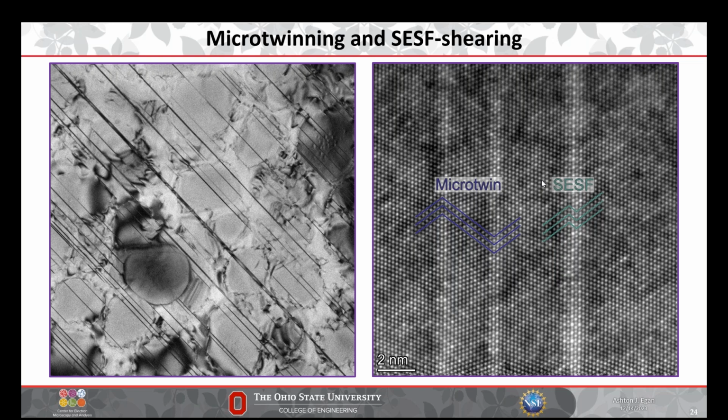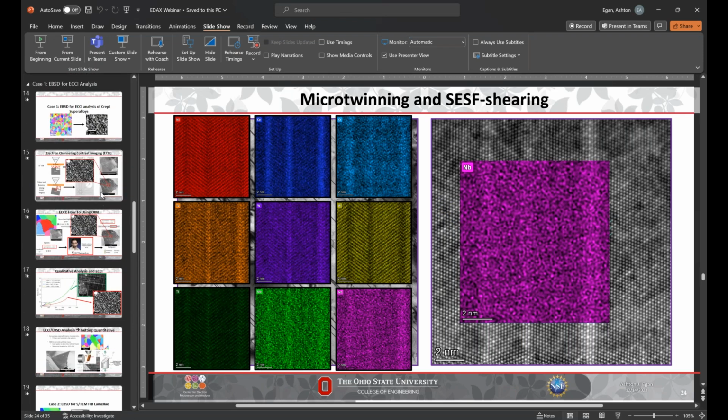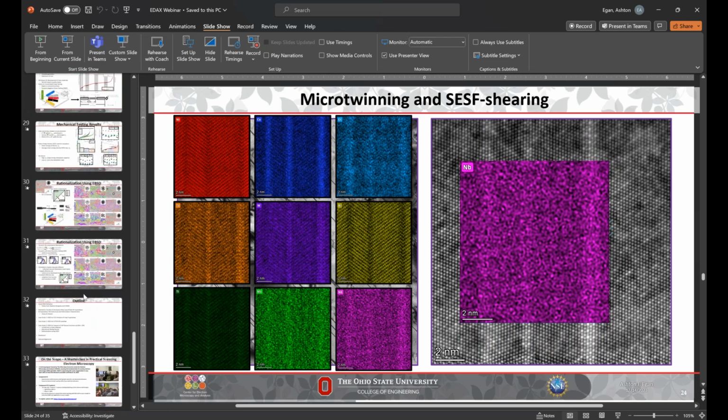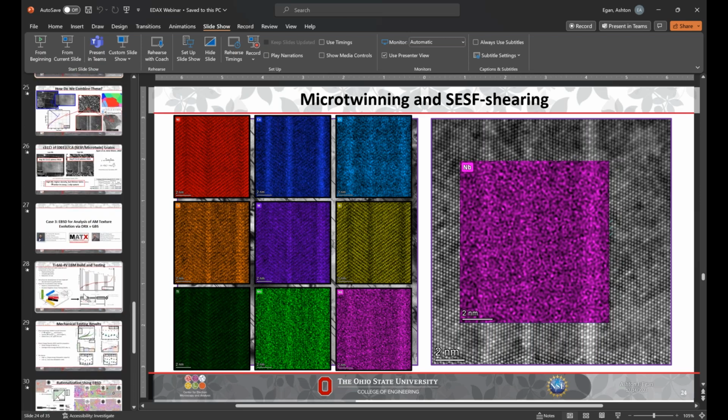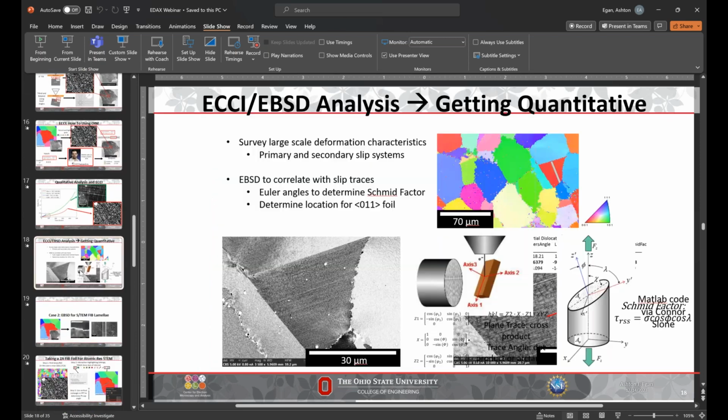Okay. What was the accelerating voltage used for ECCI analysis, and how does it relate with tilt angle and rotation? Yeah, so you can use a couple different settings. I've done ECCI both at 5 and 20 kV. I think on one of these slides, it actually specifies what my settings were for that image. Maybe not. But in reference to the angle, I'm assuming you're talking about the angle of the beam or the convergence angle, which is honestly unknown.